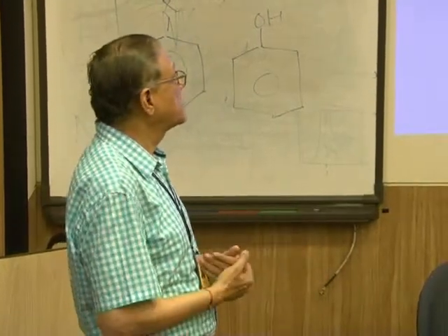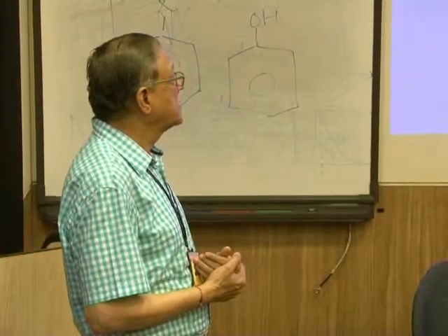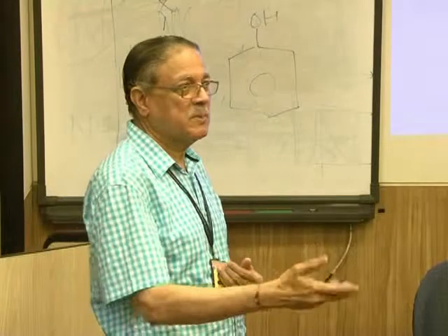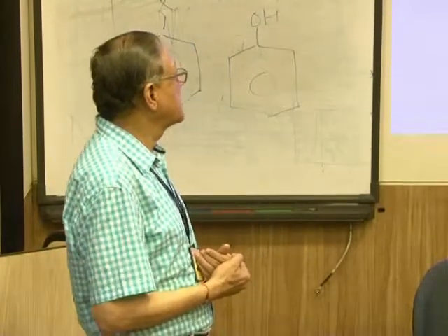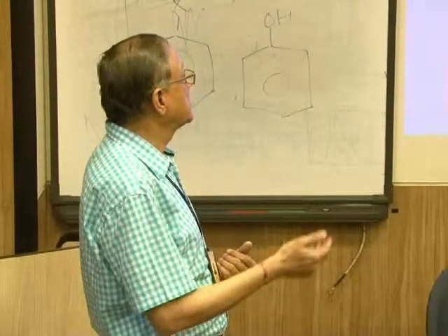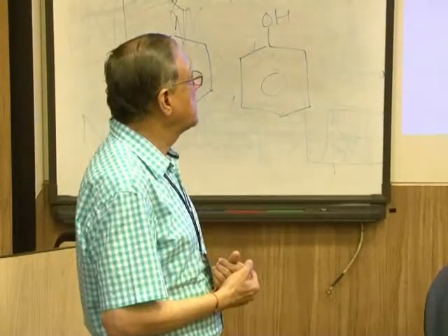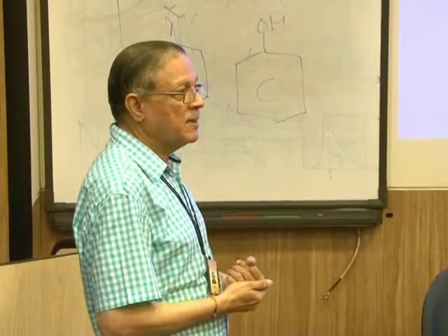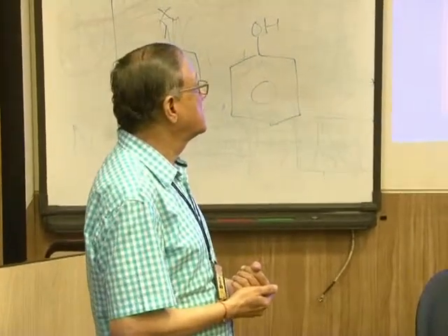Yes, we have seen that yesterday, the characteristics of the carrier gas. It should be inert, dry and free from impurities. This also we have seen. The effect of water also we have seen yesterday. Next.